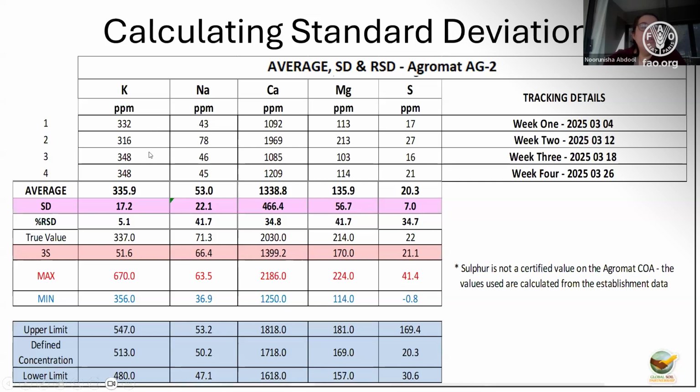So you will see I do different sets of samples, different weeks. These are averages of samples. So I've done 10 in week 1, 10 in week 2, 10 in week 3. I then calculate their average and I put them there. This is just a small example of the samples. I prefer doing 10 or more, but it also depends on the costs and availability that's going to influence the laboratory.